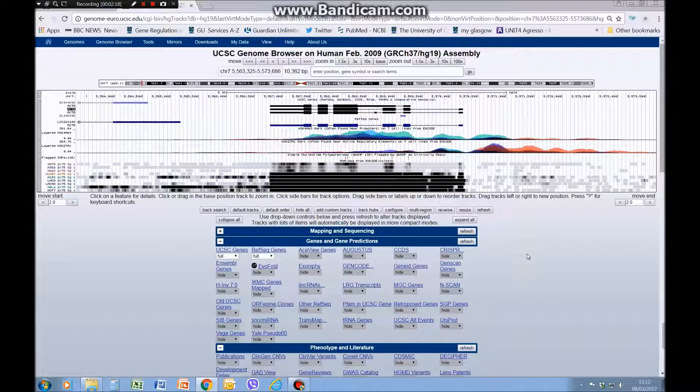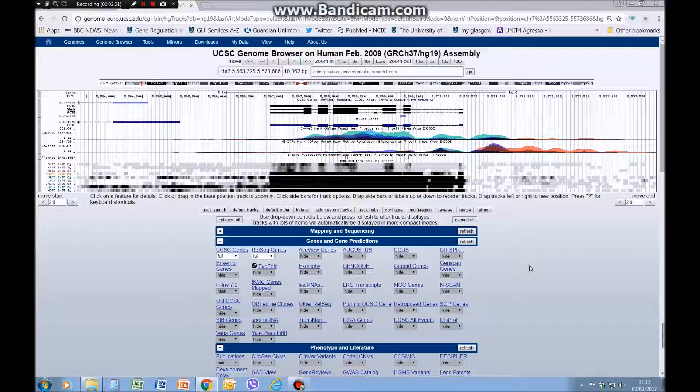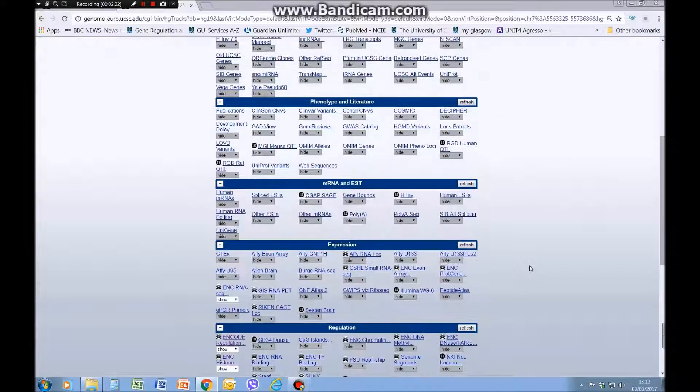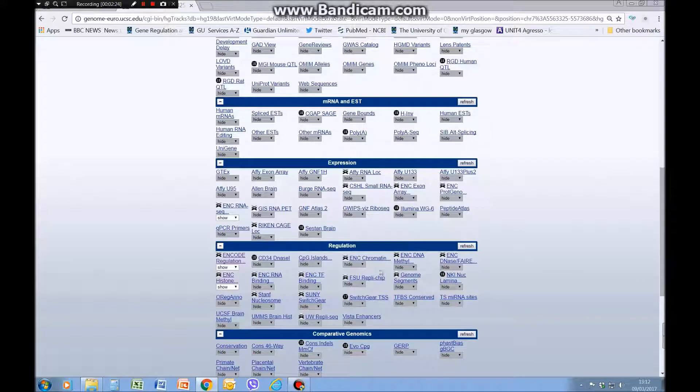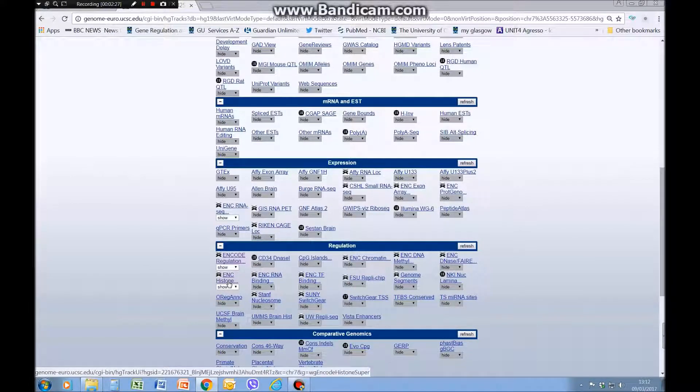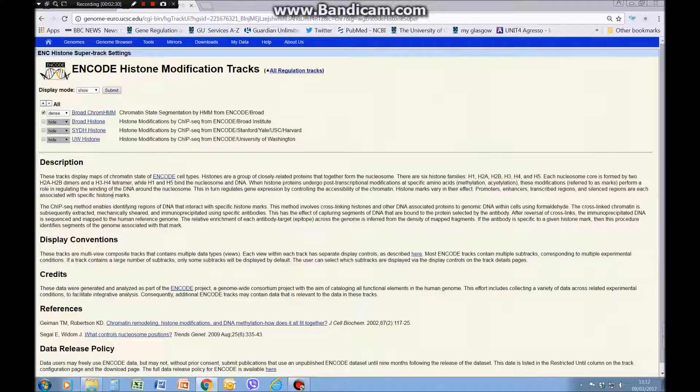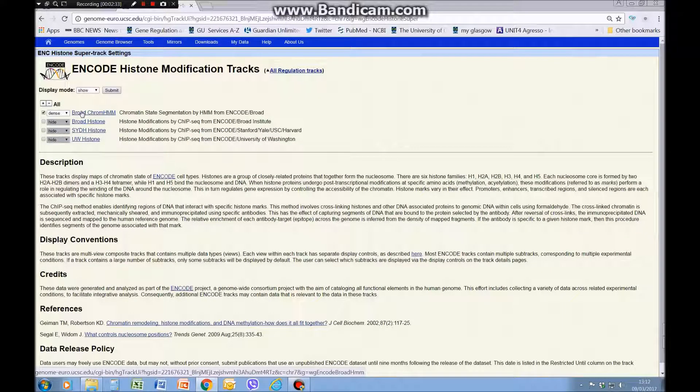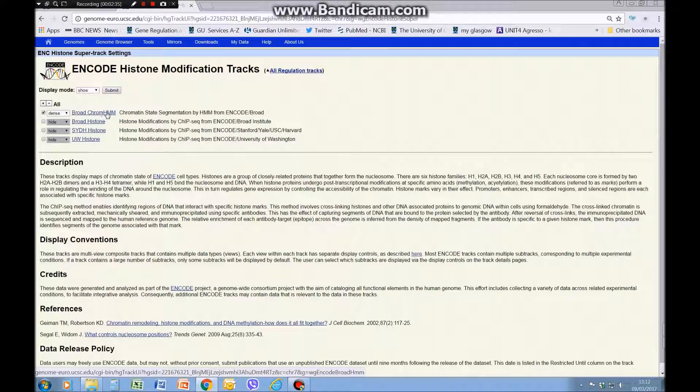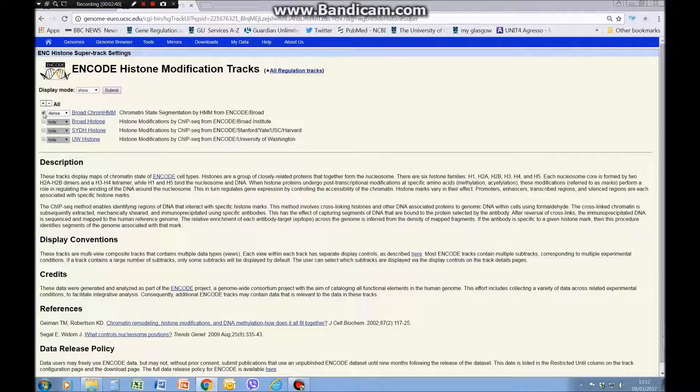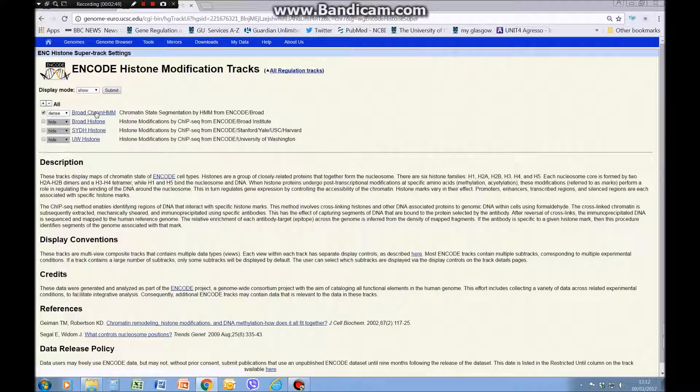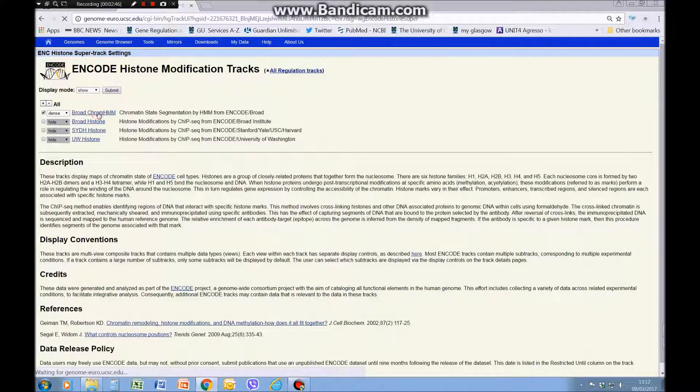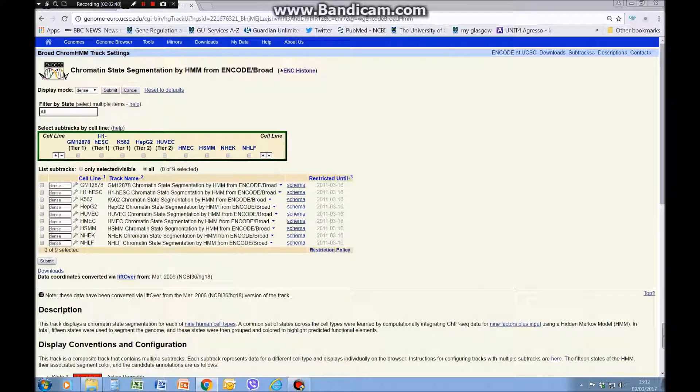The other really useful thing to do is look at chromatin state maps. To do that we go down again to the regulation menu and now we're looking at ENC histone. We'll click on the link for ENCODE histone and here we want the Broad, that's the Broad Institute chromatin histone modification maps.